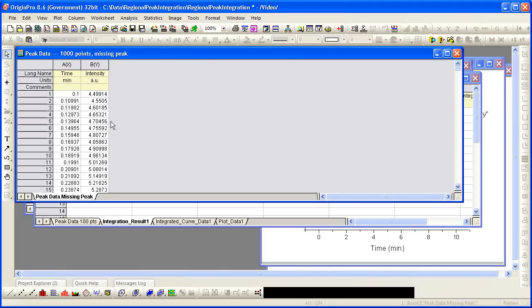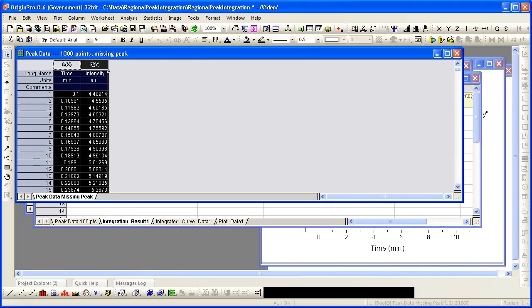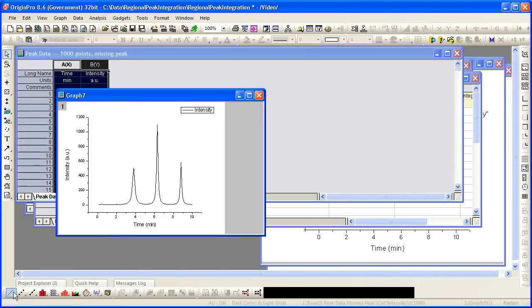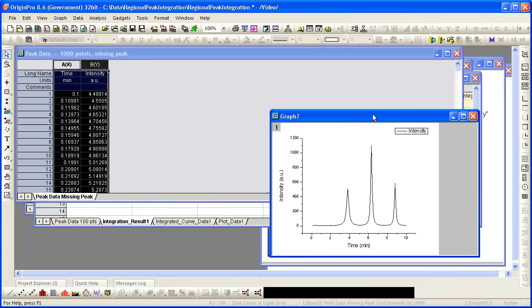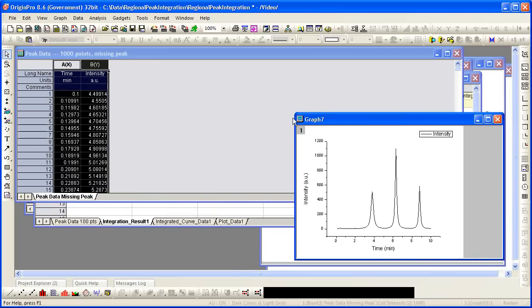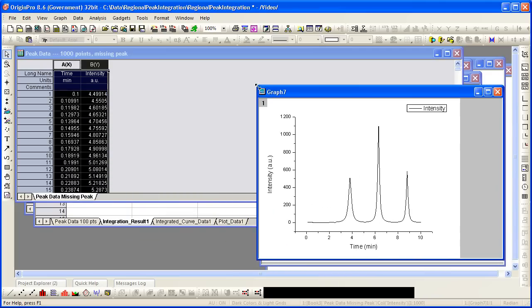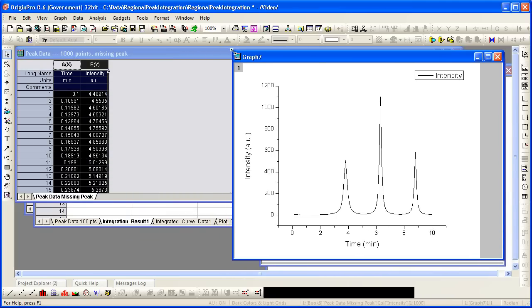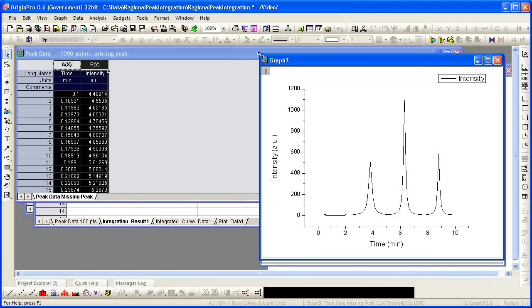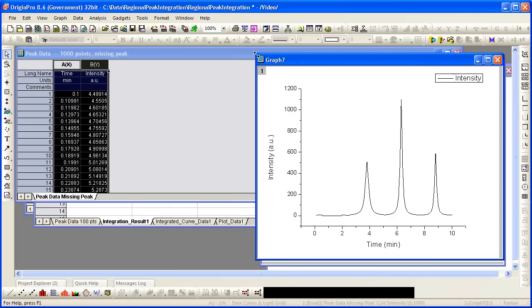In another example, I would take the 1000-point dataset but now you can see I've eliminated one of the peaks. So we essentially have a zero peak and we'll see how origin deals with that.